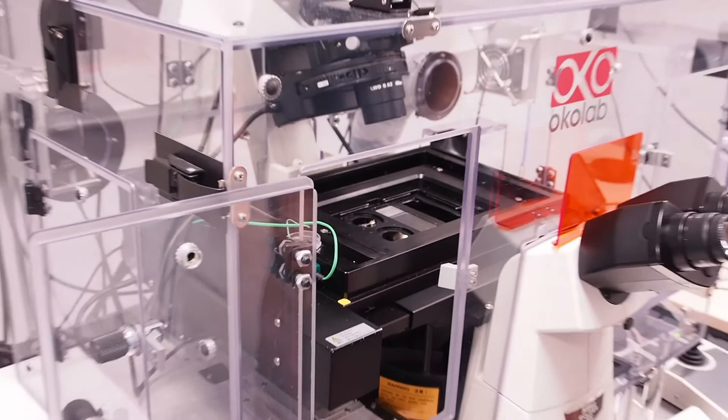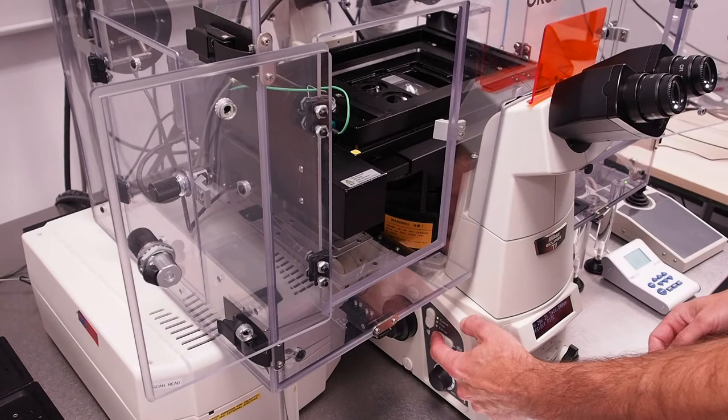Now use the objective turret control on the left of the microscope to move to your desired oil immersion lens as shown on the LCD screen.